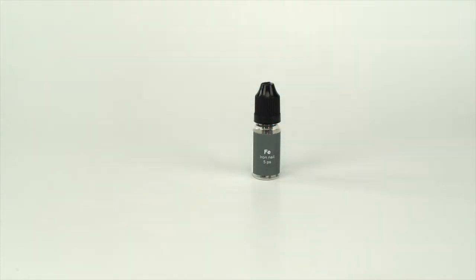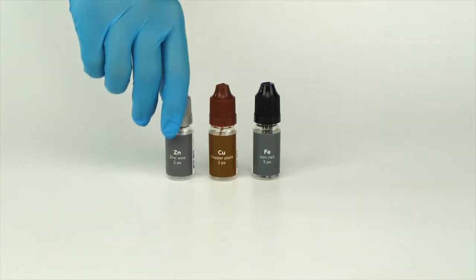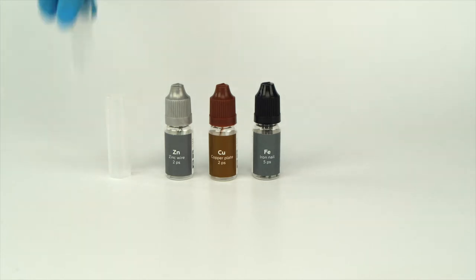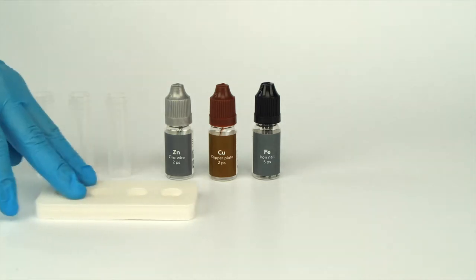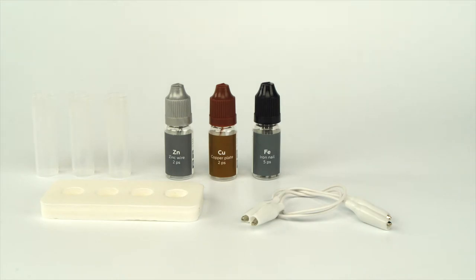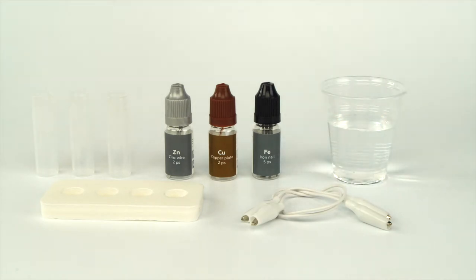For the stopping corrosion experiment, you will need the iron nails, copper plate, zinc wire, three vials, the vial stand, and the white crocodile clips from your experiment kit. Prepare a cup of water as well.